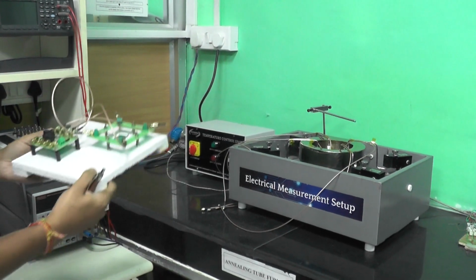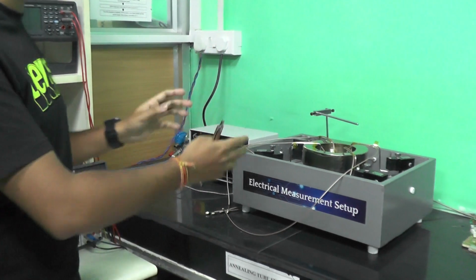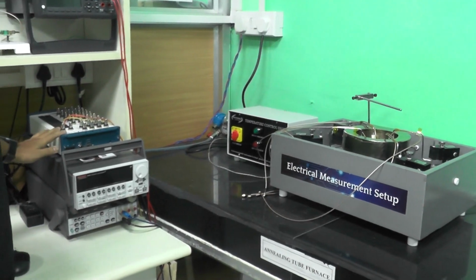This PCB is used as a switching network, because we integrate all of the systems into our LabVIEW system using our NI DAQ system.